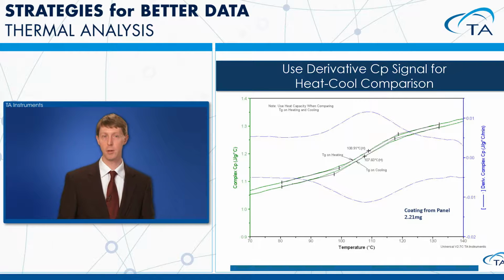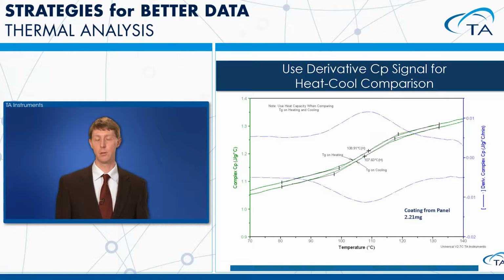Now, derivatives can be used in DSC. They're not as common as in TGA, but in this case, you can see that the derivative curves are accentuating the change in baseline shape that surrounds a glass transition of this particular data set.